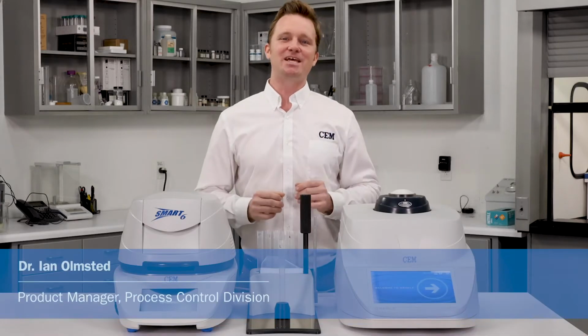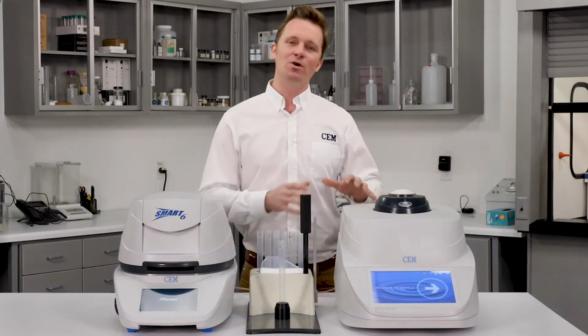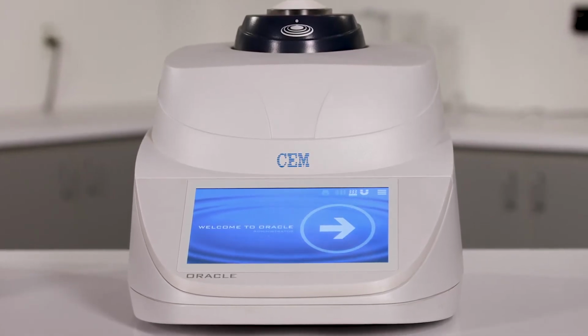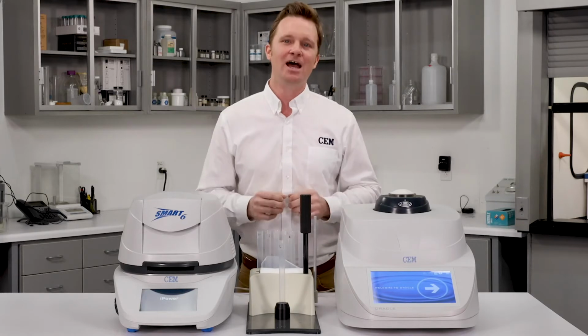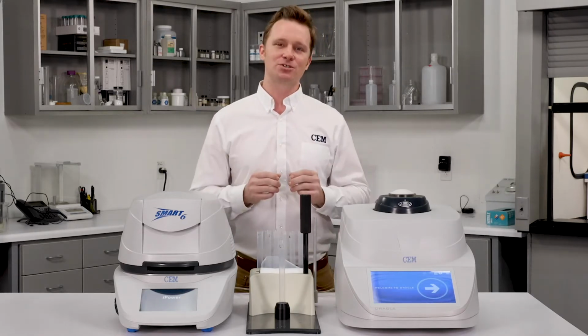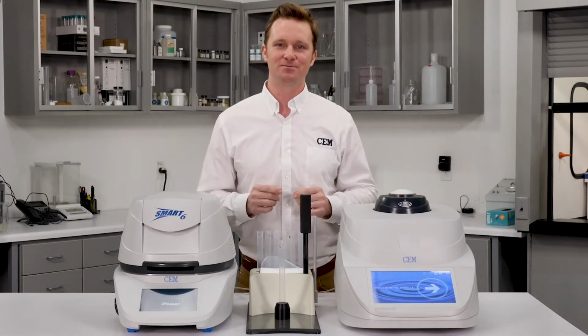In this video, we're going to take an in-depth look at the ORACLE Universal Fat Analyzer. We'll cover how this technology works and how it compares to other rapid analyzers on the market. I'm going to show you how easy and simple it is to run a sample on the ORACLE, but more importantly, I'm going to show you why the ORACLE is the right choice for feed manufacturers who are looking to improve their process control and maximize profitability.